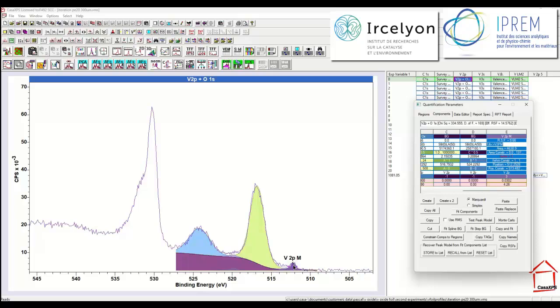Whenever we have attenuation to inelastic scattering of a photoemission peak, that attenuation appears within the background. So we should not underestimate the amount of background signal that will be generated by the metal.